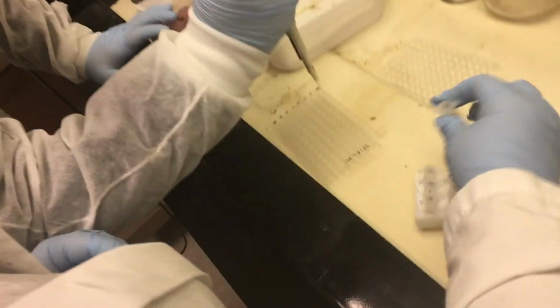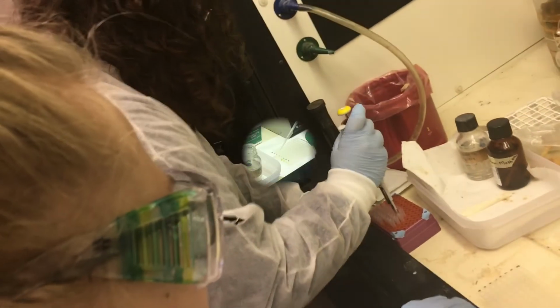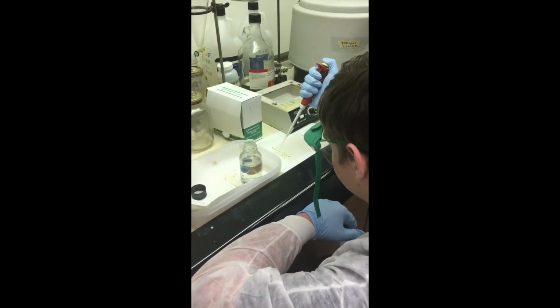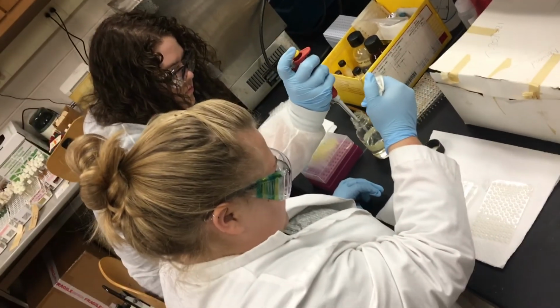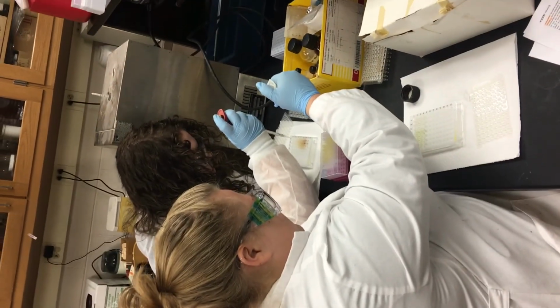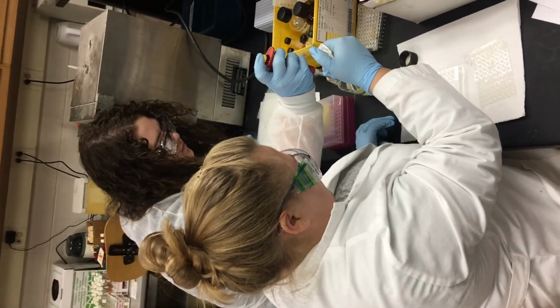We allowed all of the liquid to evaporate from the wells and prepared a standard plate using an oil and chloroform mixture. We added 100 microliters of sulfuric acid to each well. We incubated these plates at 90 degrees Celsius for 20 minutes. We took initial absorbance readings at 540 nanometers with a microplate reader. We added 50 microliters of vanillin phosphoric acid, let them sit for 10 minutes, and then took readings again.